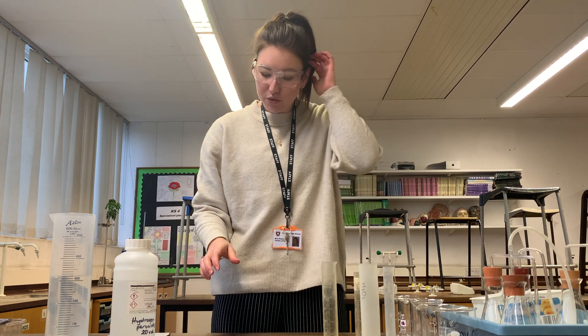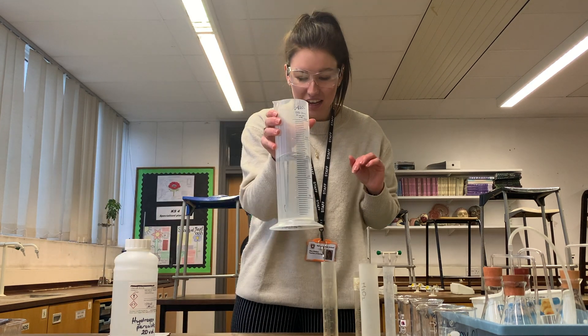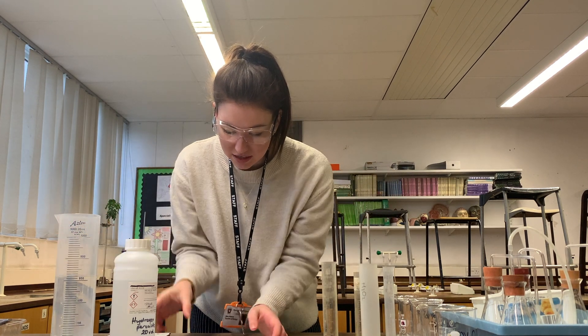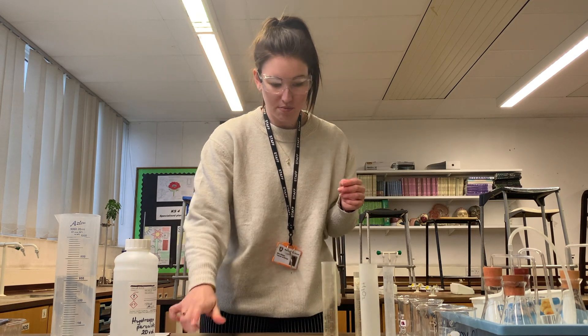We have to put 40 centimetres cubed of distilled water — currently in this giant measuring cylinder — into the 16 vol beaker, and 160 centimetres cubed of 20 vol hydrogen peroxide.